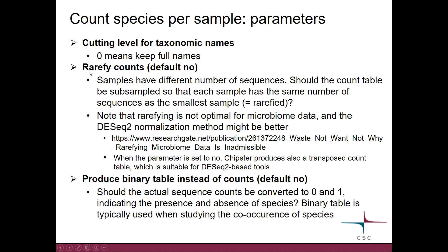Then you need to decide if you want to rarefy counts — the default here is no. What does this mean? As we have seen already, the samples have different numbers of sequences. So here you need to decide should the count table be subsampled so that each sample in the end has the same number of sequences as the smallest sample — do you want to rarefy counts, in other words?